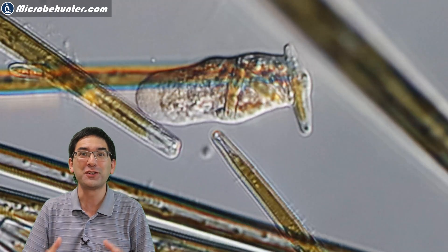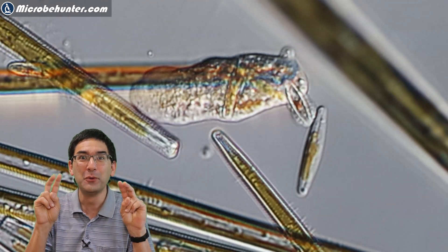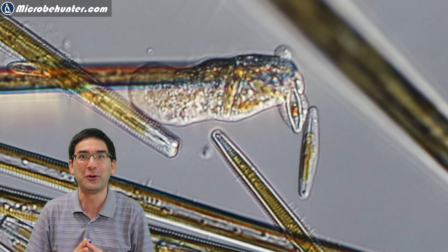Well, this here is an amoeba which is right now in the process of pooping out a fairly large diatom.